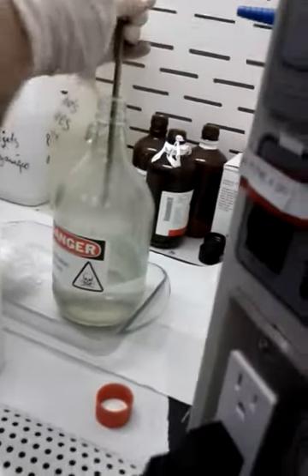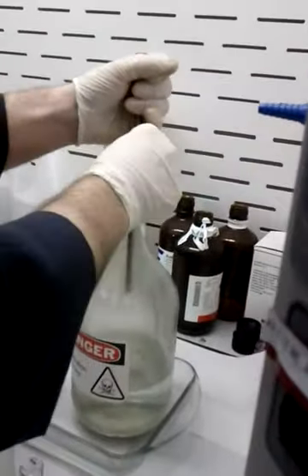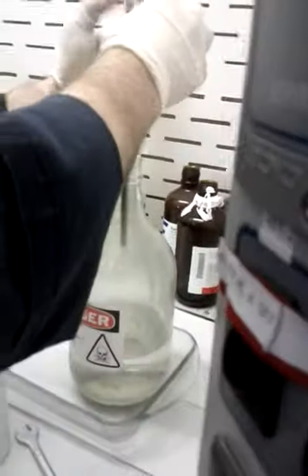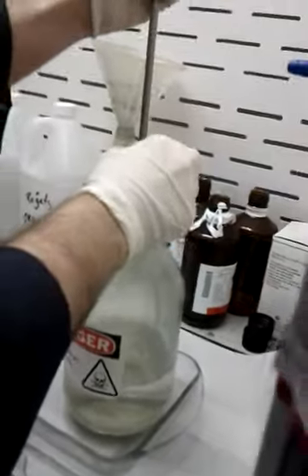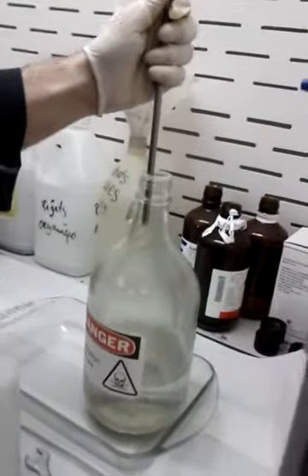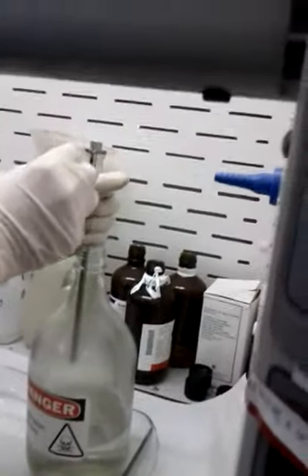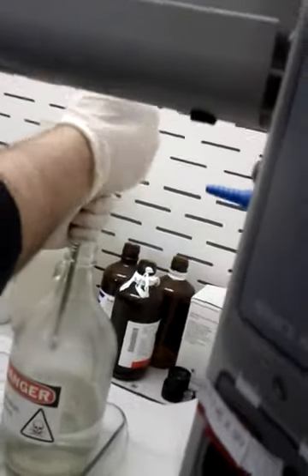We will unscrew the plates at the top. And now we will take this and slide it on the sides to have an air entry, and then the mercury drops in the platen.